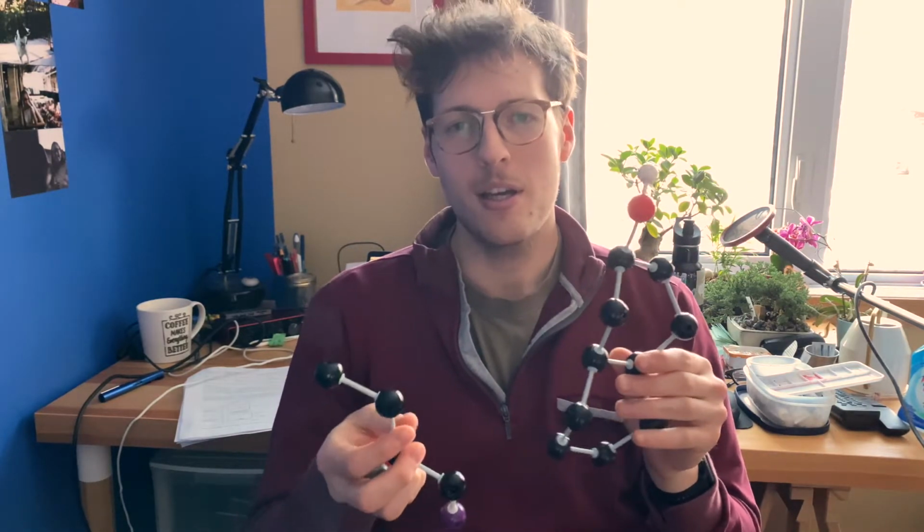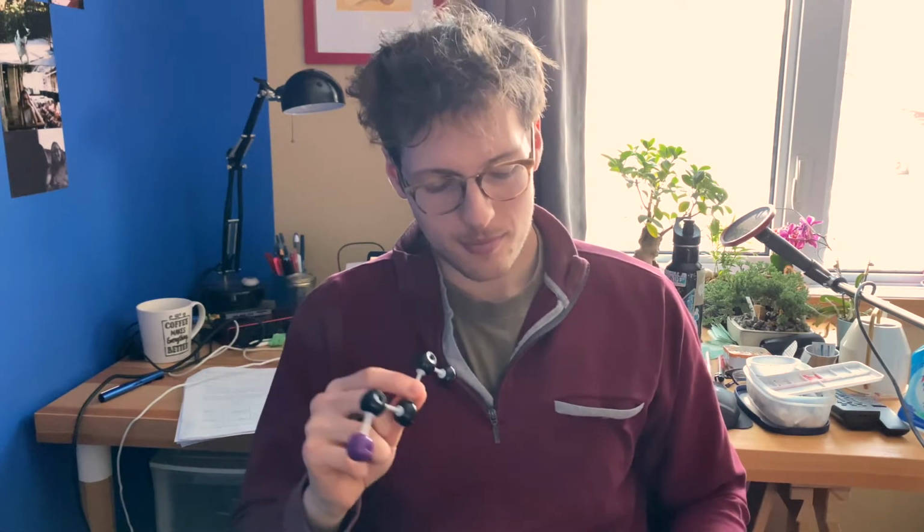All right, hello again. So today we're going to be discussing the reaction that the third experiment underwent, and I'm going to use some models here. The process was to use 2-naphthol and sodium hydroxide and ethanol along with iodobutane in order to produce 2-butoxynaphthalene, which is a flavoring agent in strawberries and raspberries, I believe.